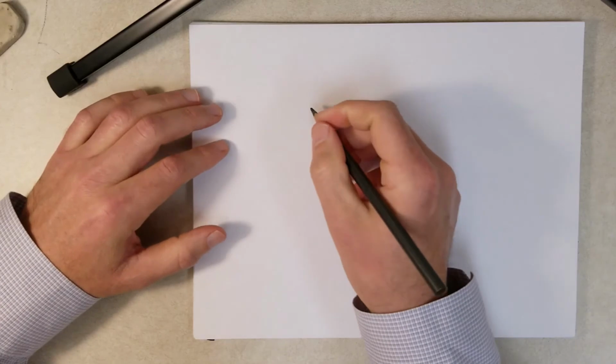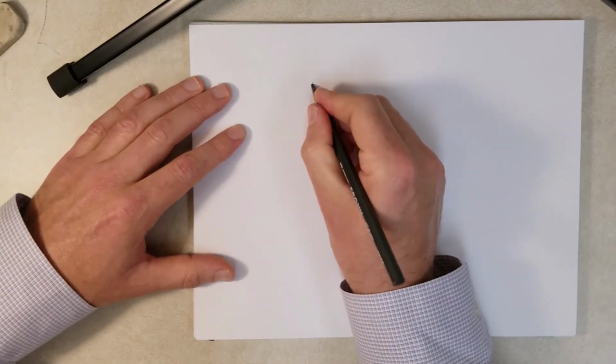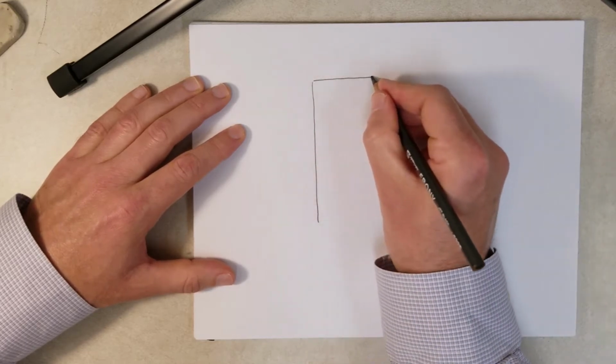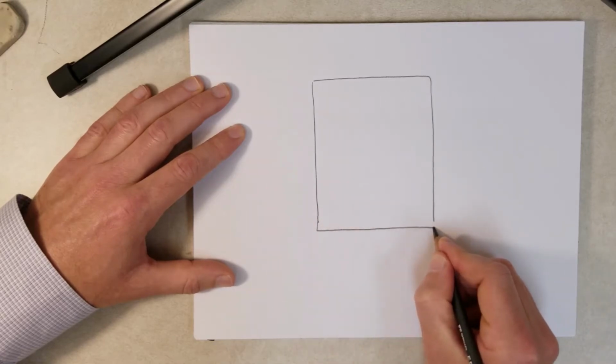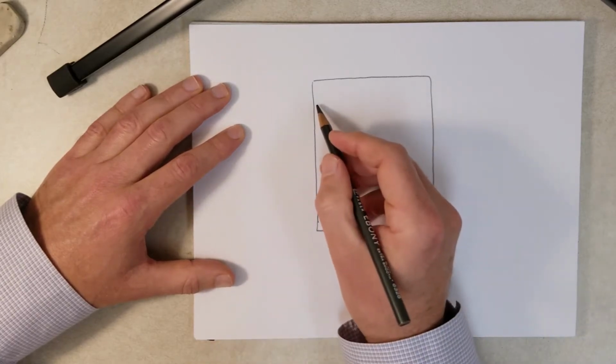Now gel electrophoresis of proteins is very similar to gel electrophoresis of DNA and RNA molecules. Usually we're using a different type of gel matrix. Usually it's an acrylamide gel instead of an agarose gel, but overall, conceptually, it's very similar.